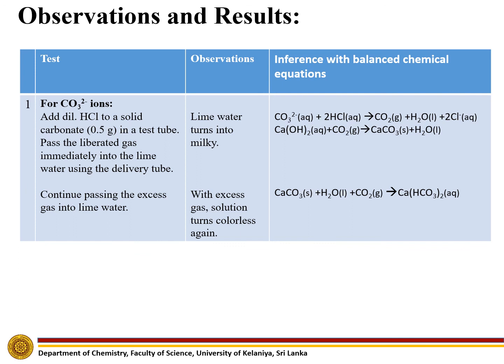But when we continue passing excess gas into lime water, the solution will turn colorless again. This is because calcium carbonate will react with water and carbon dioxide to form calcium bicarbonate.